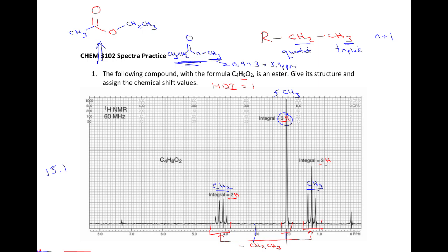It's not sounding good. But if I go over here to the structure that I have on the top left, I take this methyl group and I say, okay, again, a methyl comes out at around 0.9, but this time the methyl group is next to a carbonyl. And when it's next to a carbonyl, I add 1 part per million, so that would give me 1.9 parts per million. That's much closer to what I'm seeing here, which looks to me like maybe 2.05 parts per million. So that's a much closer approximation, and that looks a lot better to me.